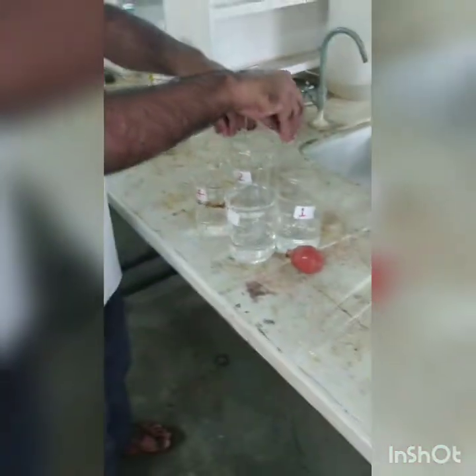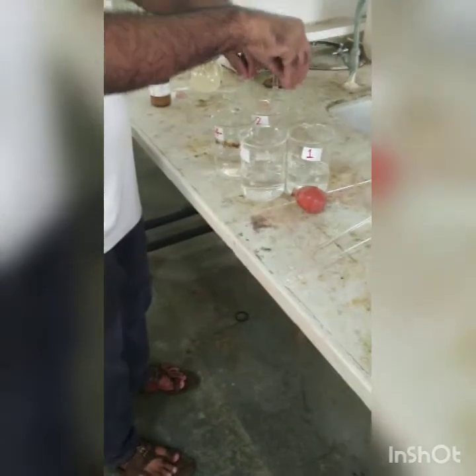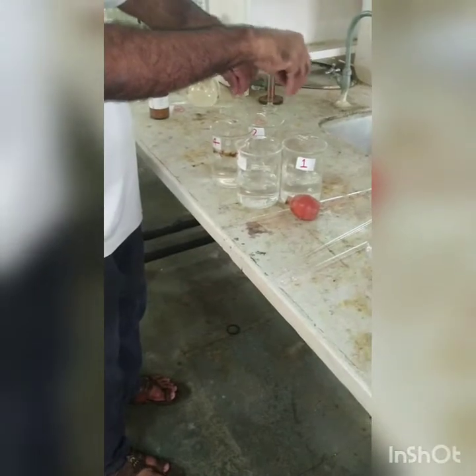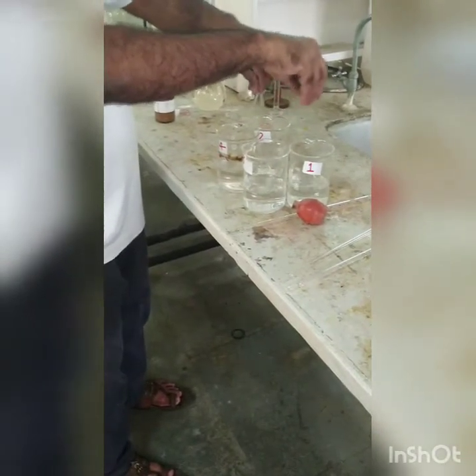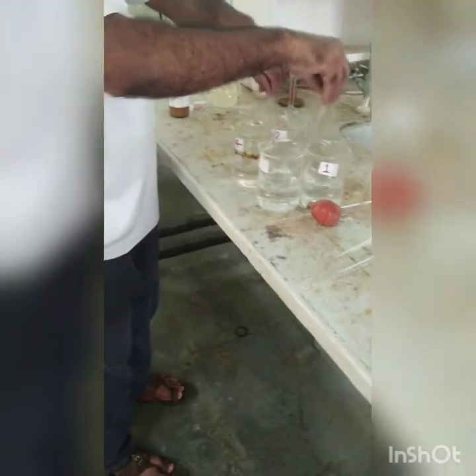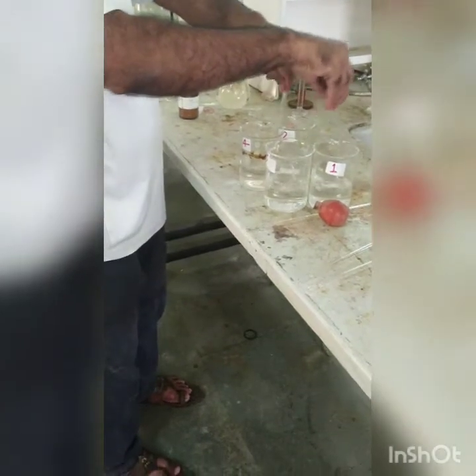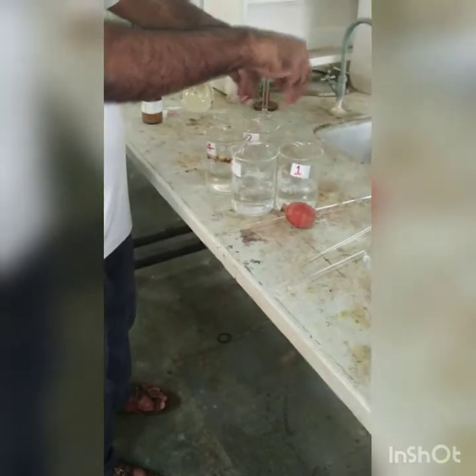So we either have under or over baffles or some kind of stirrers, or chlorine is injected at many points in the clear water sump, and as the water is in motion, some water is coming from the filter bed and some water is leaving the system, either getting pumped and distributed. So water always will be in motion and automatically chlorine is getting mixed. So we are doing this stirring here for 10 minutes.